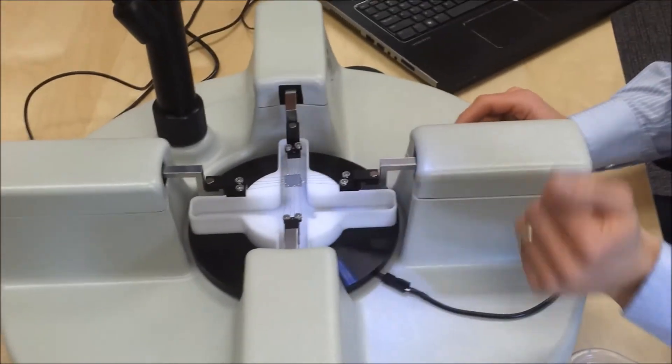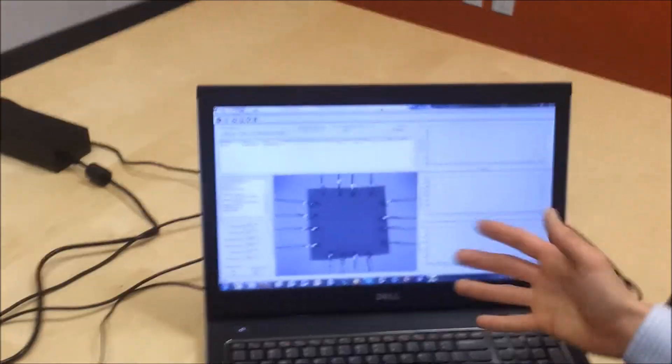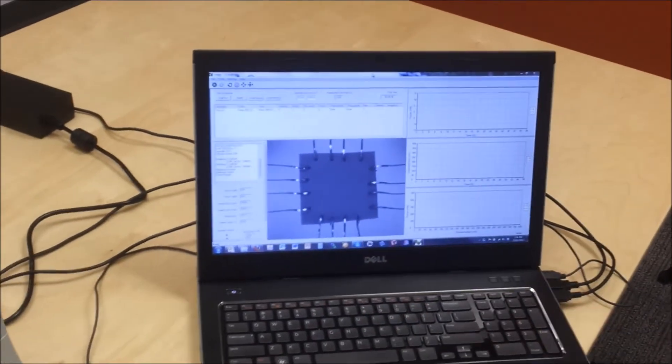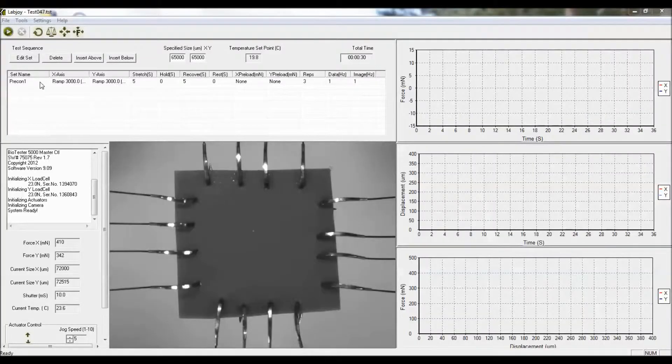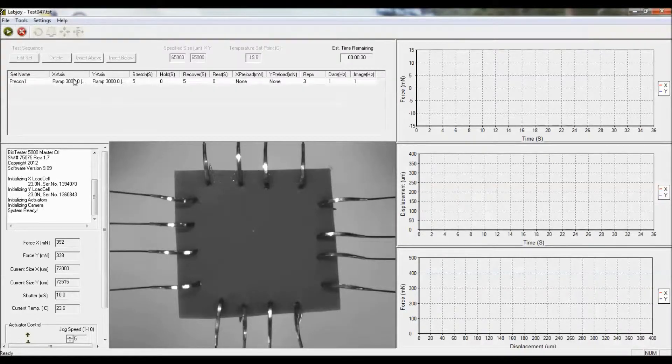Now that we've got the specimen mounted, we're going to go over to the computer here, and we can see on screen that we do have the specimen showing up in the middle of the screen. And this test is ready to run. In this case, I've specified a test that has a ramp of three millimeters in five seconds. I'm just repeating that three times. So I'm going to execute this test.